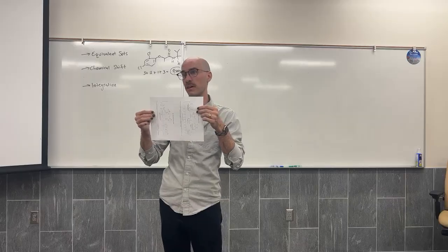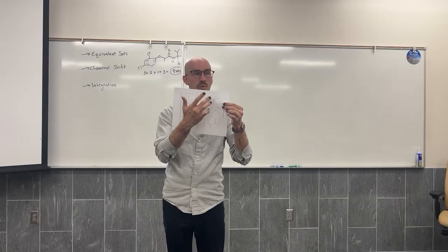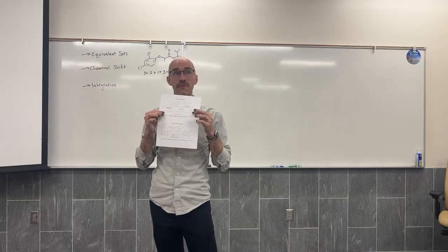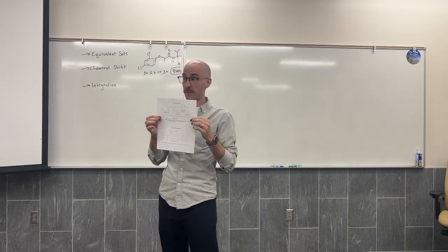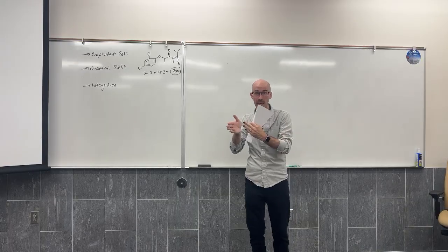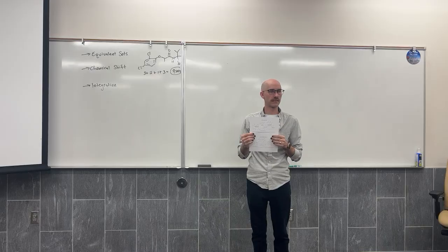That's what your textbook gives you, a full NMR spectrum with more specific ranges. Mine is by far the most vague and the most broad. And in my opinion, that makes it the easiest to use because it helps you quickly narrow in on things and then make assessments based on what's present.